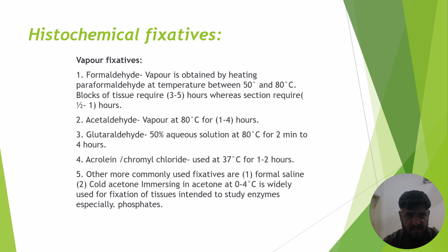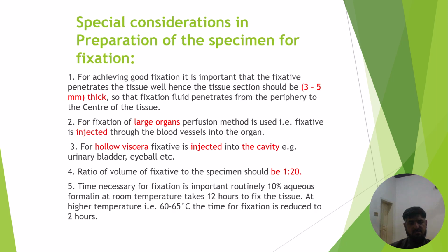The third group is histochemical fixatives. Mostly vapor fixatives like vapors of formaldehyde, acetaldehyde, and glutaraldehyde can be used for histochemical fixation of the tissue.